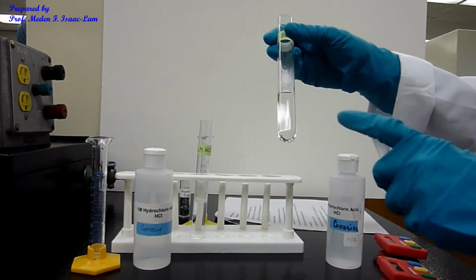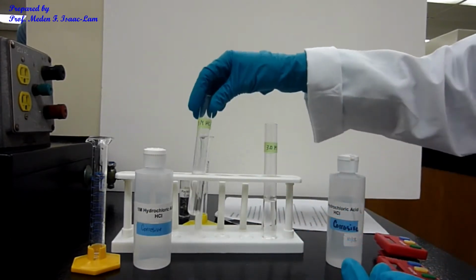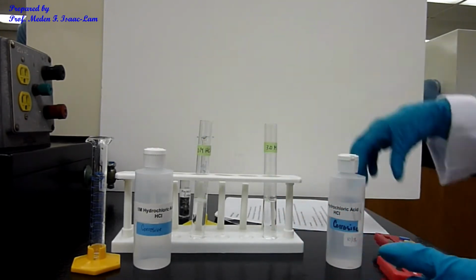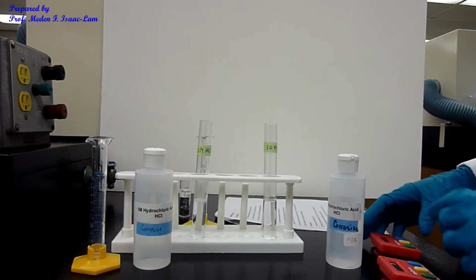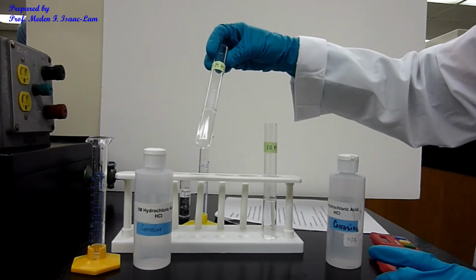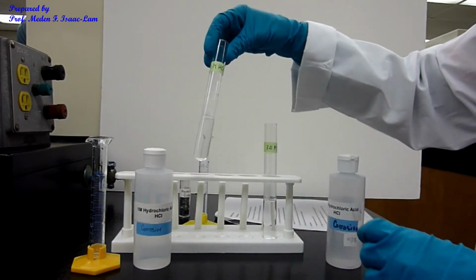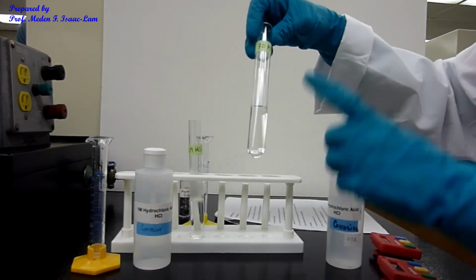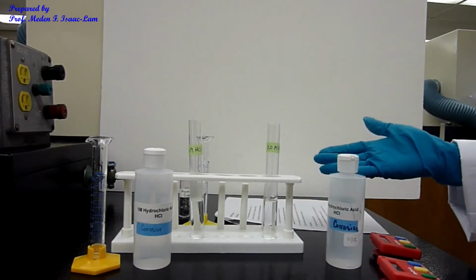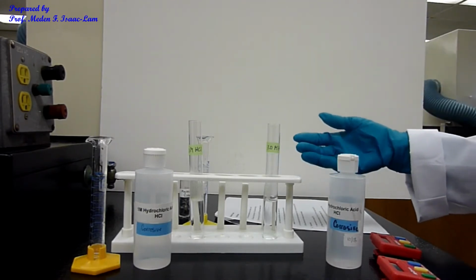So obviously this one is much faster. Actually, the magnesium disappeared, while this one is still reacting. That one, in like 23 or 24 seconds, it's done, while this one at 1 minute is still reacting. You can see the bubbles, and this one stopped bubbling. So that's the effect of concentration on reactivity. The higher the concentration of hydrochloric acid, the faster is the reaction.